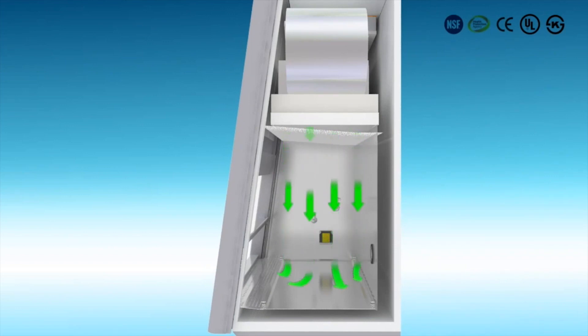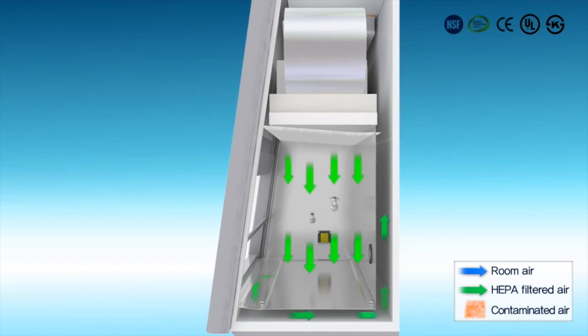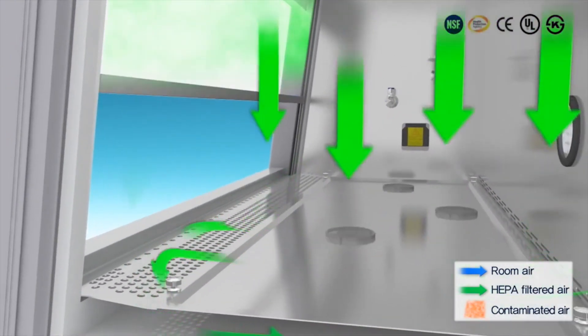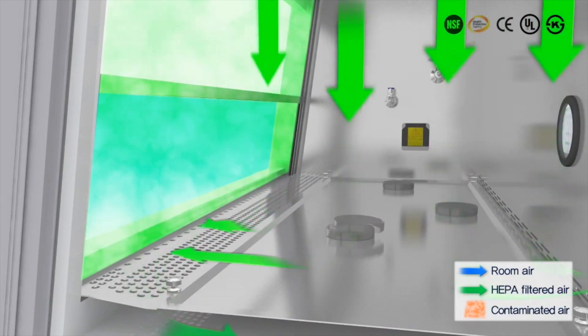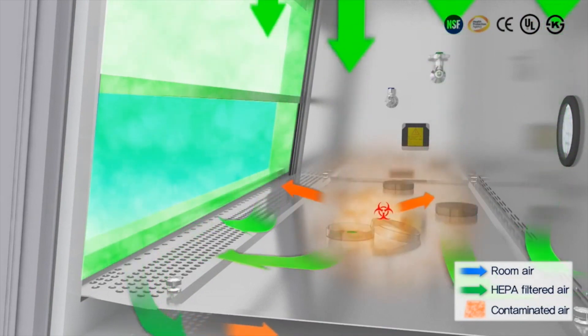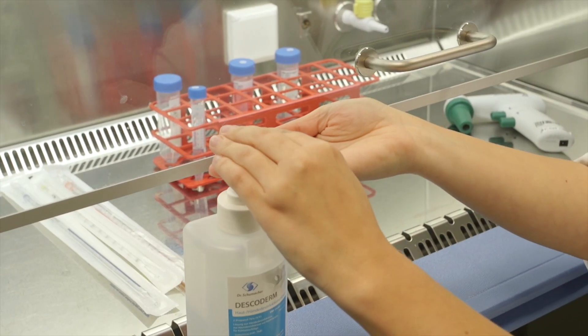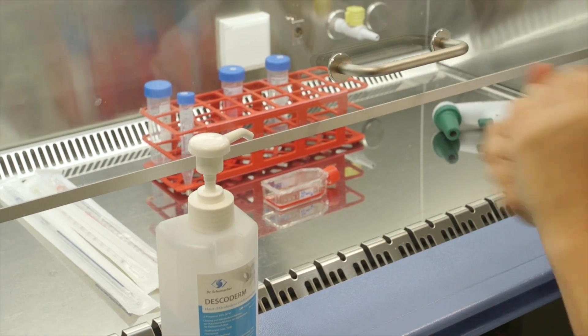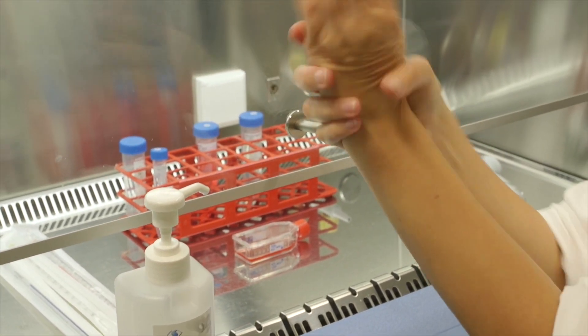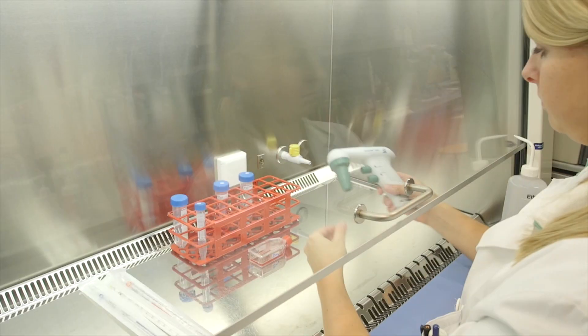Because the cells must be kept sterile, we have to work in the flow cabinet. The airflow in this cabinet flows in a particular direction that ensures a sterile environment. In this video, you can see the airflow paths. The best place to work is approximately in the centre of the cabinet, and it is important to keep a tidy work environment.